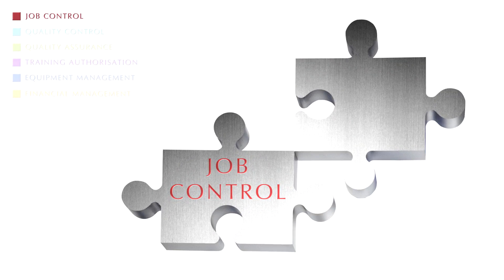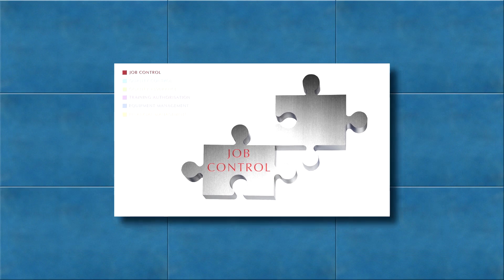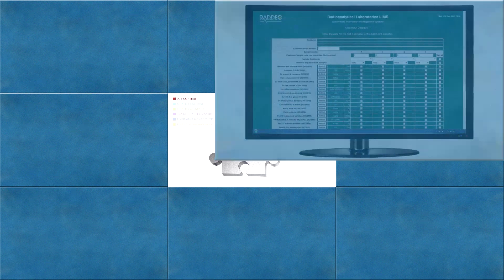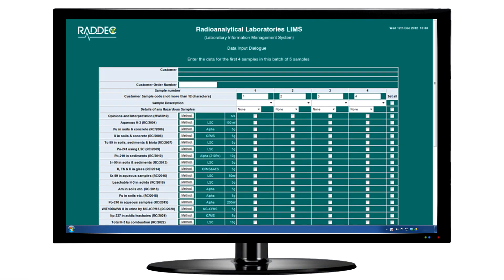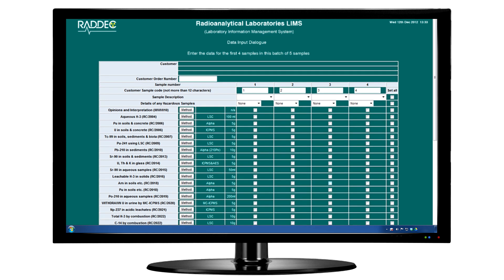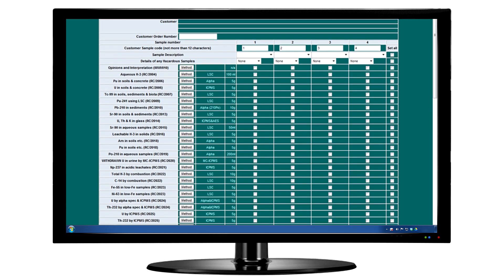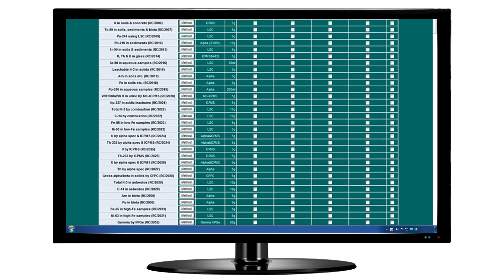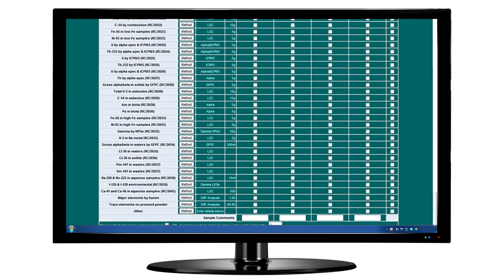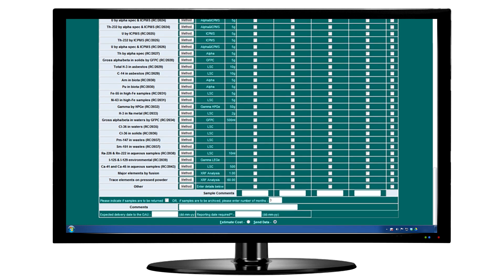Job Control. With RADEC LIMS, a job-based structure is used to manage tasks or customer data. All information relating to a particular job is entered onto LIMS by analysts. Sample details and analysis requirements are entered, along with storage information and expected delivery and reporting dates. The system then generates unique job and sample codes to permit easy sample tracking.